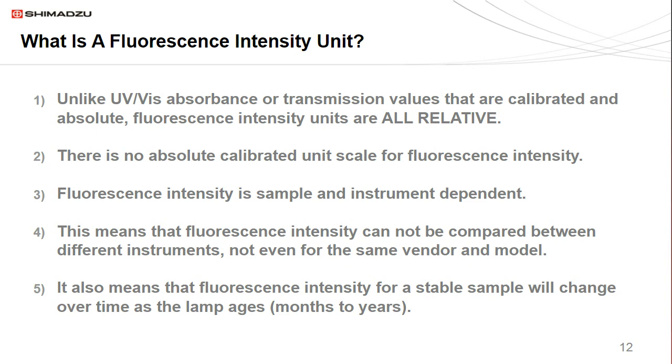This points to the importance of running a calibration standard for concentration, which is absolutely vital in real time with your data. You must run a calibration standard every time you run unknowns so that you can standardize the fluorescence intensity value to a concentration.